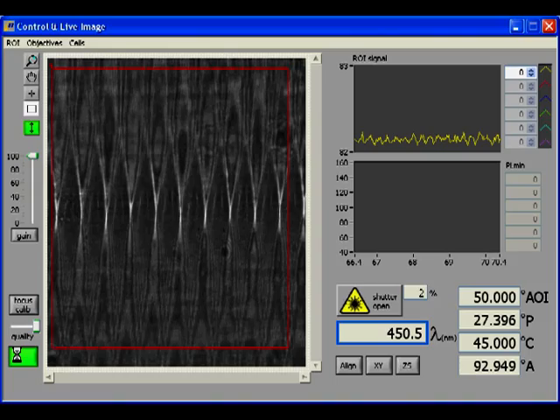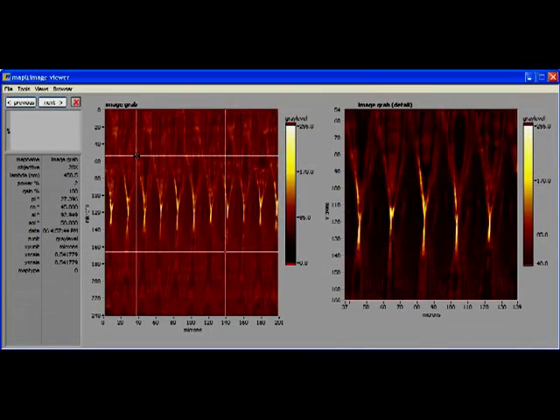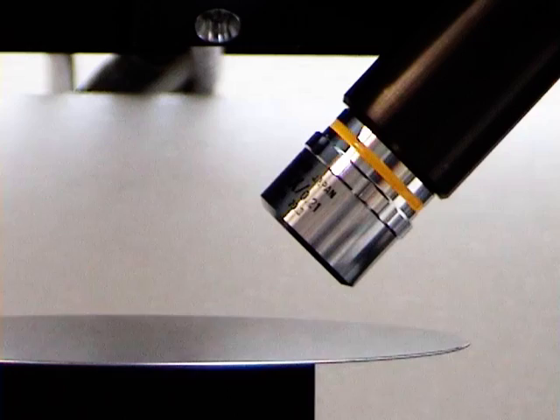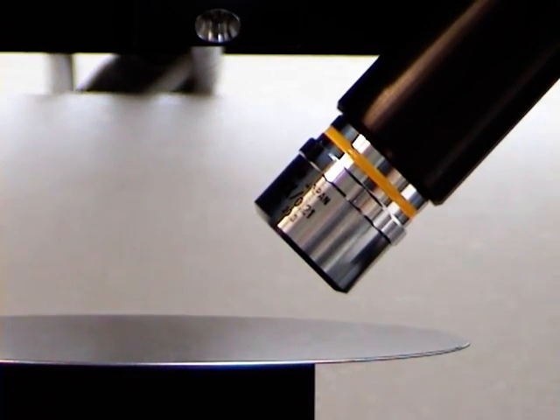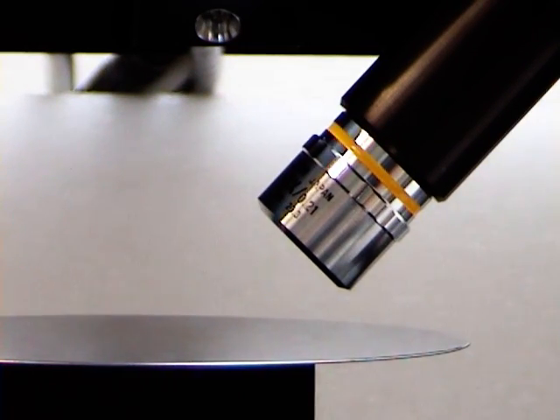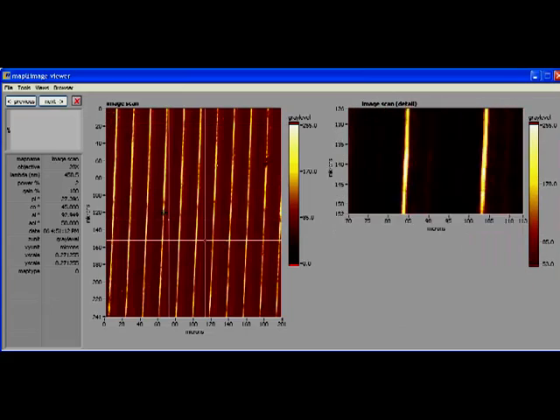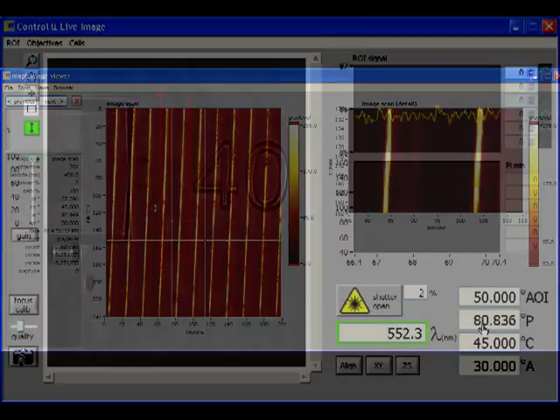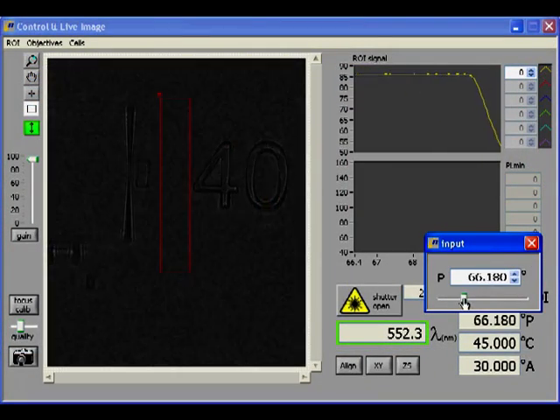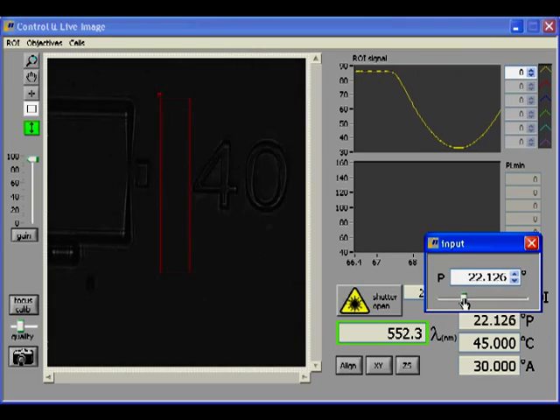For physical reasons, only one strip of the overall image is focused during the angle-dependent observation. Thus, Nanofilm has developed the focus scanner, which puts together a sharp overall image out of a series of focused strips. The ellipsometric contrast is enhanced by rotating the optical components.